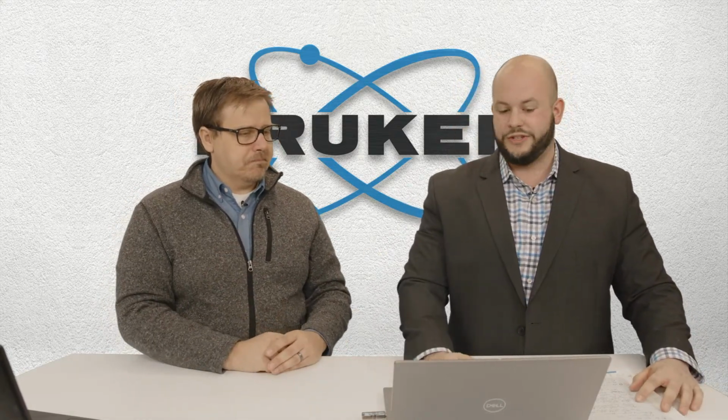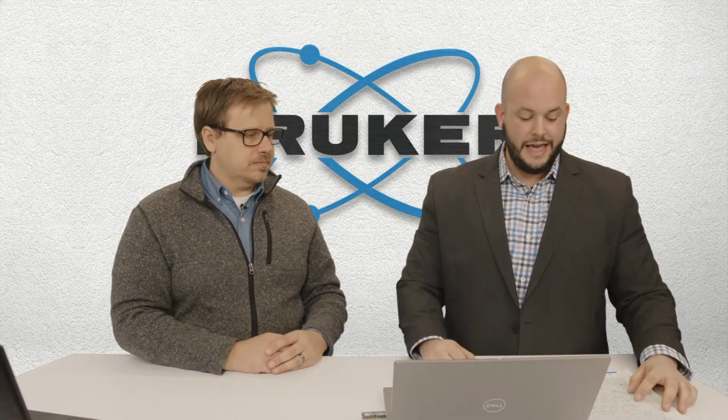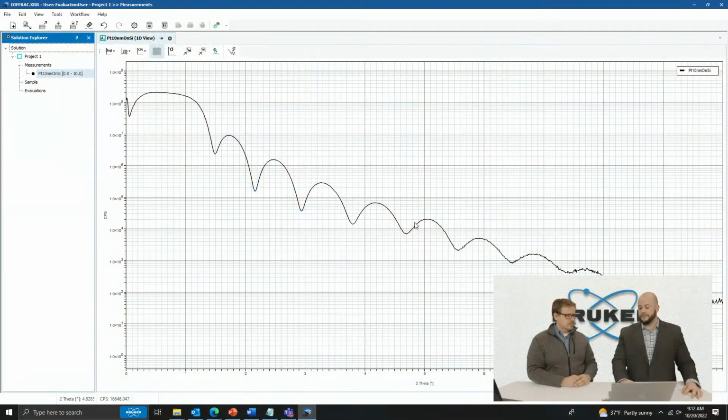What's useful is the spacing between these fringes can be used to quantify the thickness of our layers. The amplitude of the oscillations can be used to determine the density differences between our layers. And the decay in signal, and also of the oscillations, is determined by the roughness of the interfaces of those layers.